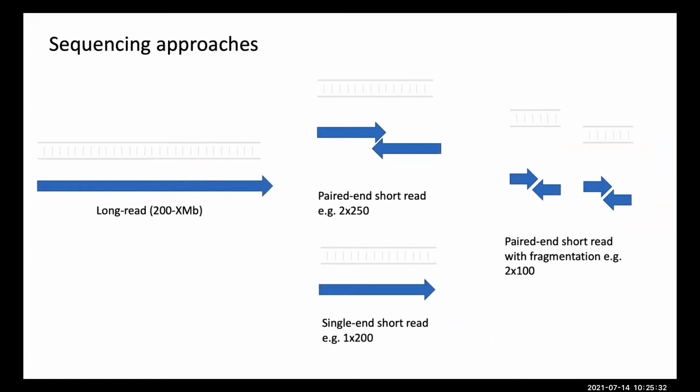And then there's also the same thing with fragmentation. So with nanopore sequencing, if you have long or short amplicons, it doesn't really matter because you can put any fragment length into the sequencer, and you will generate one amplicon read from one end to the other.